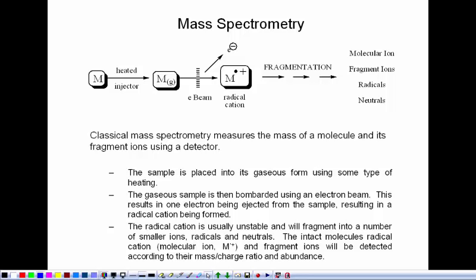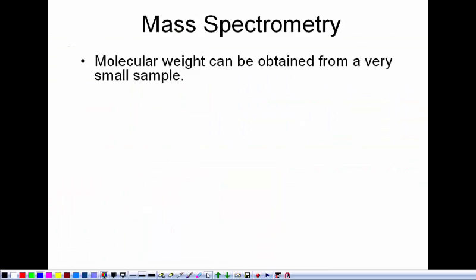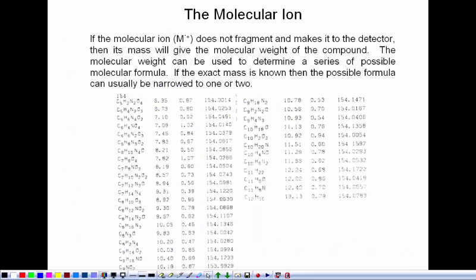Okay, we're going to start with finishing up mass spectroscopy, talking about fragmentation. There will be a homework assignment that I will post today where I'm going to give you some mass spec and ask you to maybe assign a couple of the peaks, or several of the peaks in the mass spectrum, based on what fragmentation looks like, which is what we're going to talk about. So we went through the basics last time, and I put that online if you want to go back and review it.